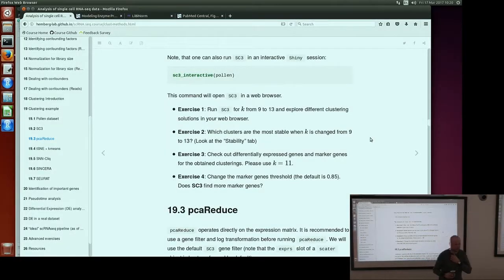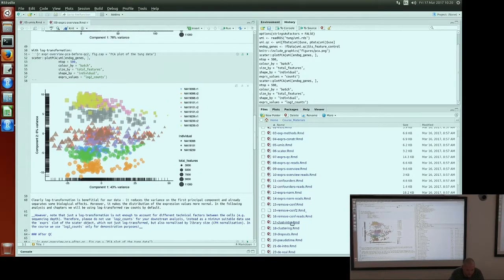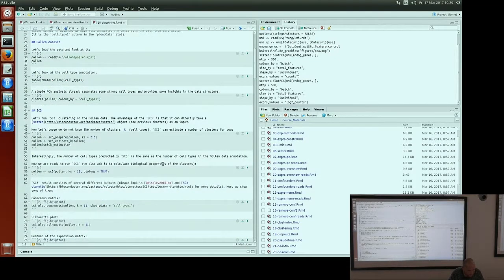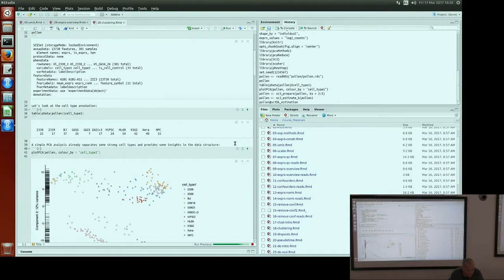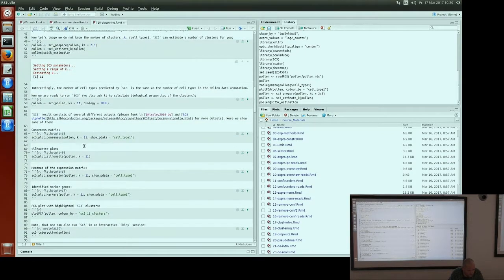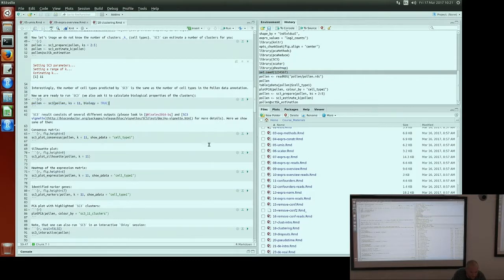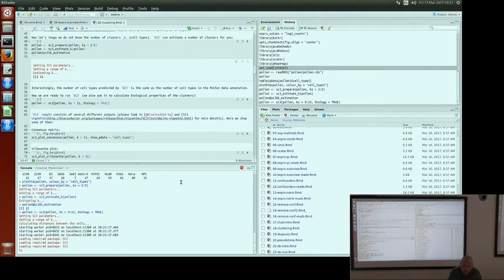I got quite a lot of questions about the interactive session, so I'll run it myself on the screen. We go to clustering chapter 18 and I'll run everything until this point, which will create all the plots and identify the 11 clusters. Then I want to run SC3 from 9 to 13. This might take some time, but we'll wait for it and then open the interactive session.